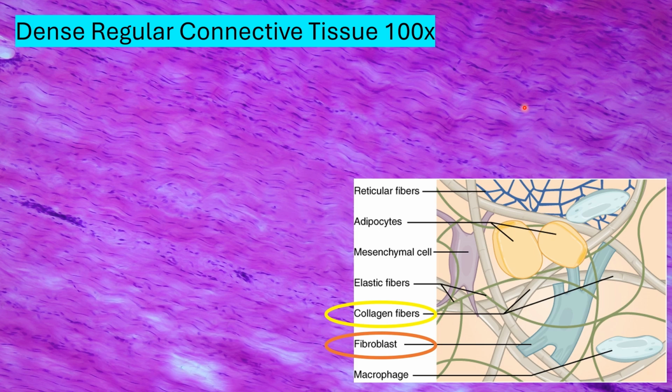Think about lifting weights and the tension that is placed on the anchored bone to get the movement, or in a ligament resisting movement, like if you were to try and bend your fingers at the joints. Now, let's zoom in a bit and see what more we can see.